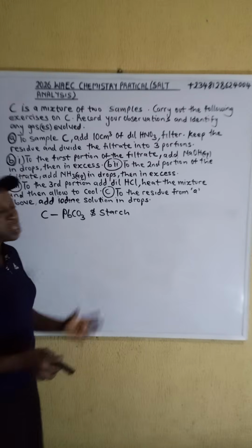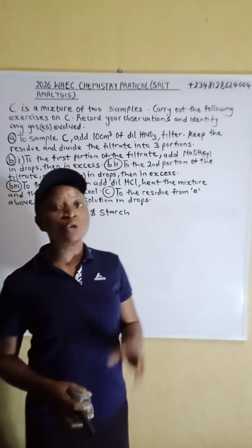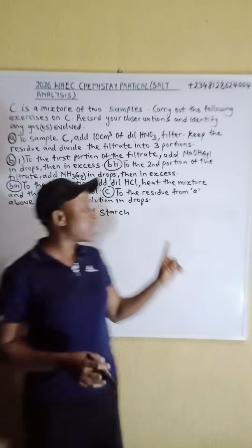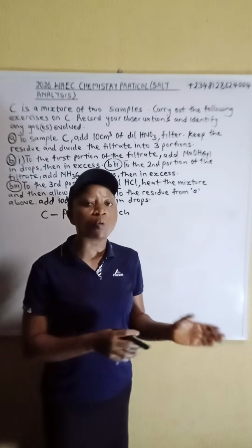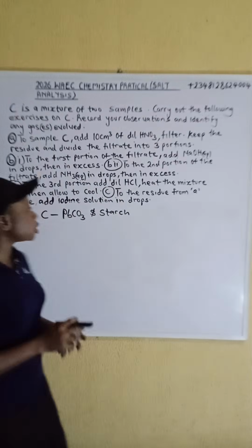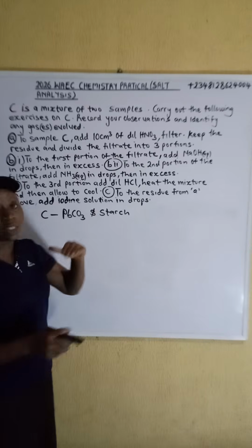Lead carbonate is insoluble in water. That is, lead carbonate cannot dissolve in water. Likewise, starch. Starch is insoluble in water. It shows that the two samples are insoluble in water.